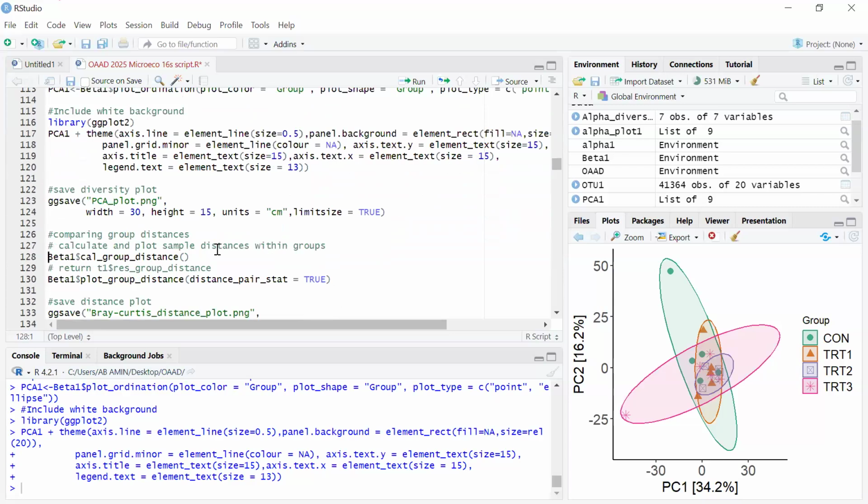Excuse me, please. This PCA that you are talking of, PCo2, I think the ellipses are almost the same, and the data you have inputted, everything we have there.